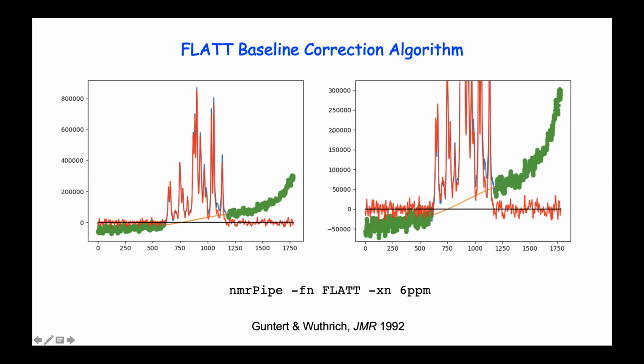So it's harder to do water suppression, and therefore it's almost impossible to get a flat baseline. So I started using a polynomial NMR processing function, poly, to do that. But sometimes it really doesn't work very well, particularly for something very dense like this. And when you apply poly, the baseline tends to sink down like this.